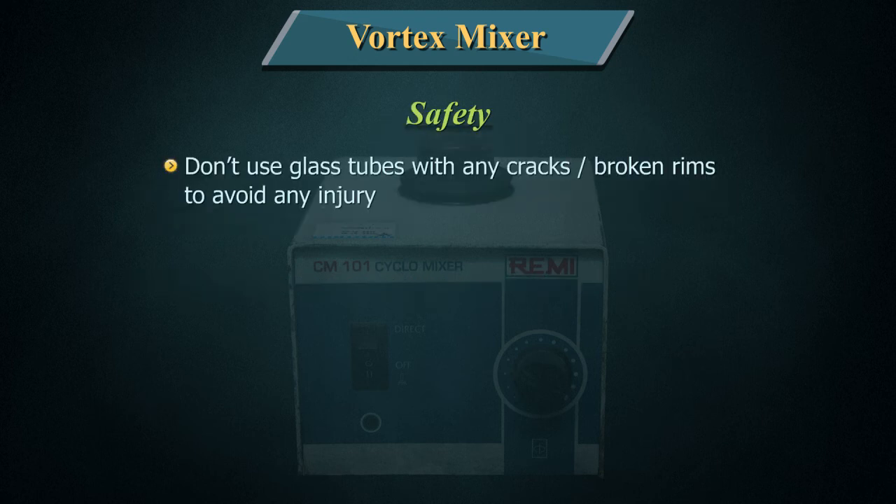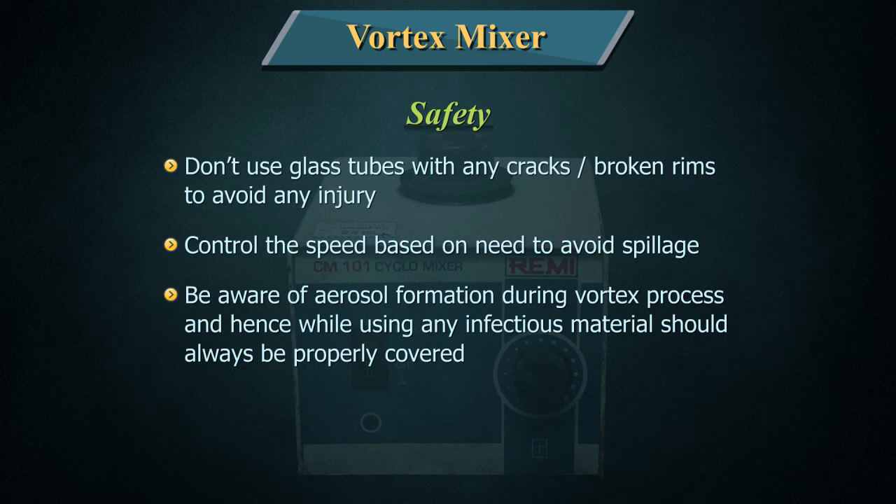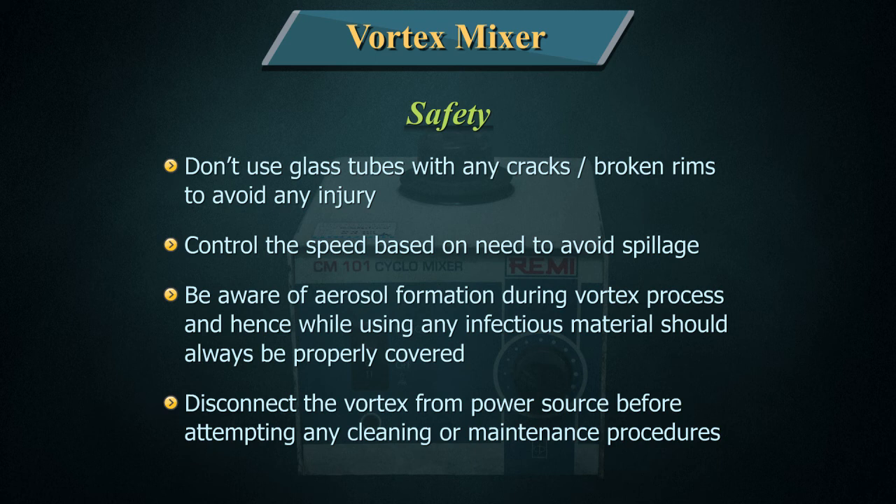Safety: Don't use glass tubes with any cracks or broken rims to avoid any injury. Control the speed based on need to avoid spillage. Be aware of aerosol formation during the vortex process, and hence while using any infectious material it should always be properly covered. Disconnect the vortex from the power source before attempting any cleaning or maintenance procedures.